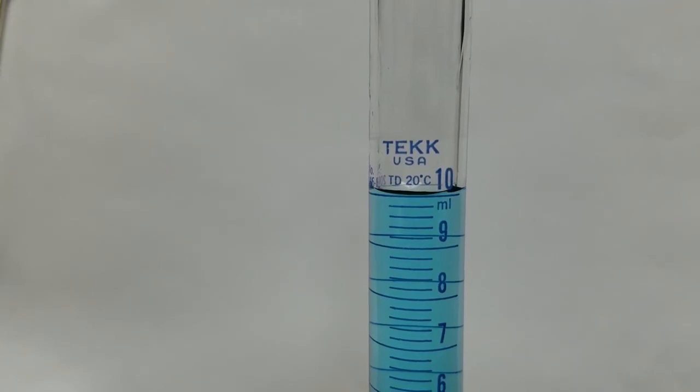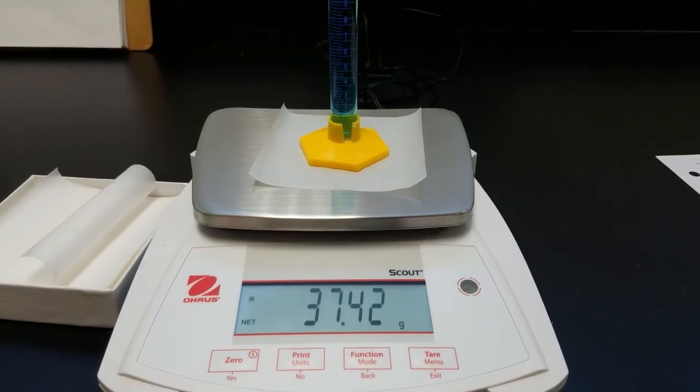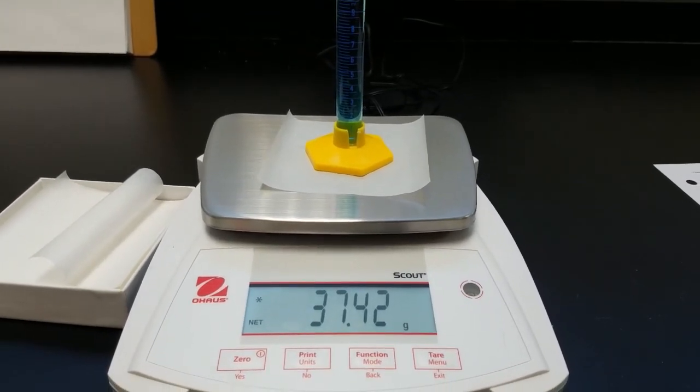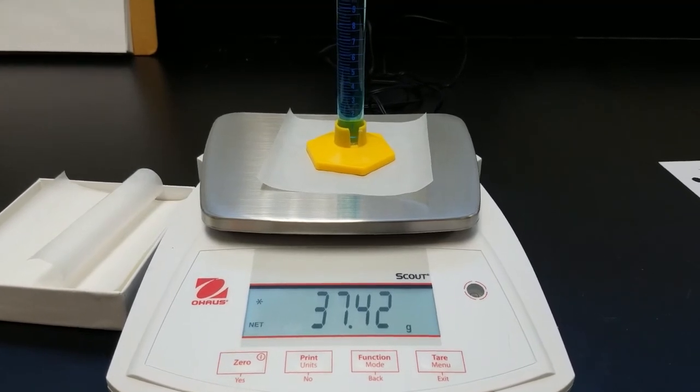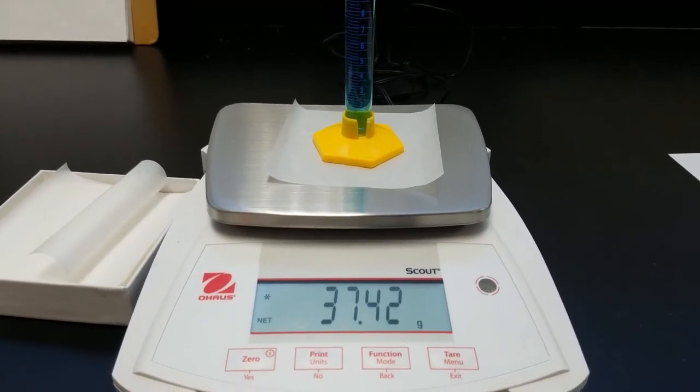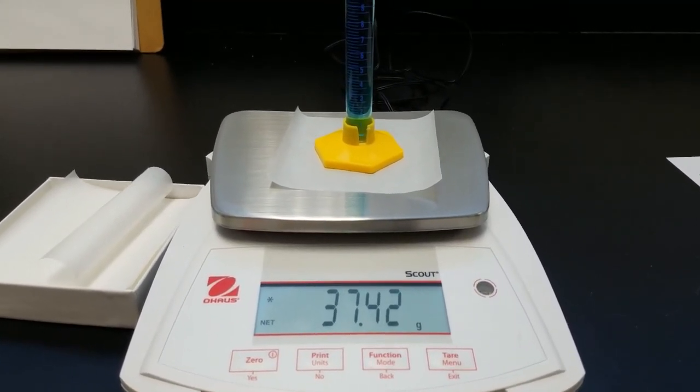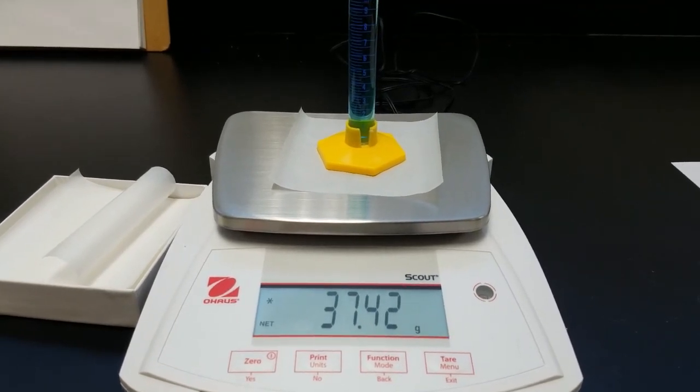Approximately two more milliliters have been added. Record the volume. Mass of approximately 10 milliliters of water. This data can now be used to do additional calculations as directed in your lab manual in Excel.